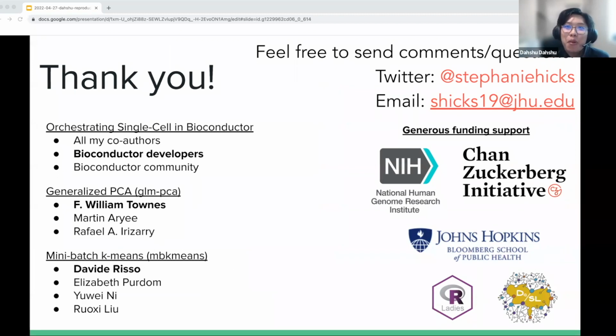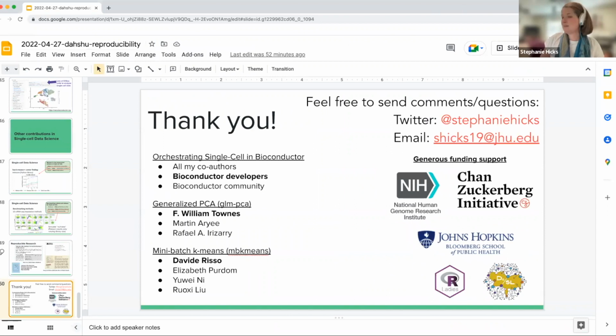I'm going to start with a very technical question. You talked about GLM-PCA. I think it's a great method. Could you very briefly comment on how it deals with single cell data with strong batch effects? Are there ways for us to model the residuals or take them out, and how does that compare to our traditional way of doing PCA with strong batch effects?